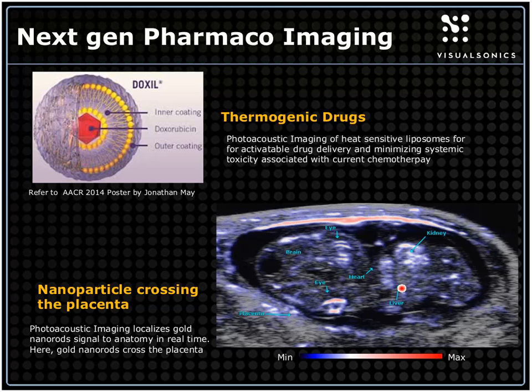This kind of assay has been used to at least evaluate whether particles can cross the placenta barrier, and if so, how it can be used for therapy in that area. While this is not necessarily cancer, this is an area of research in the next generation imaging.